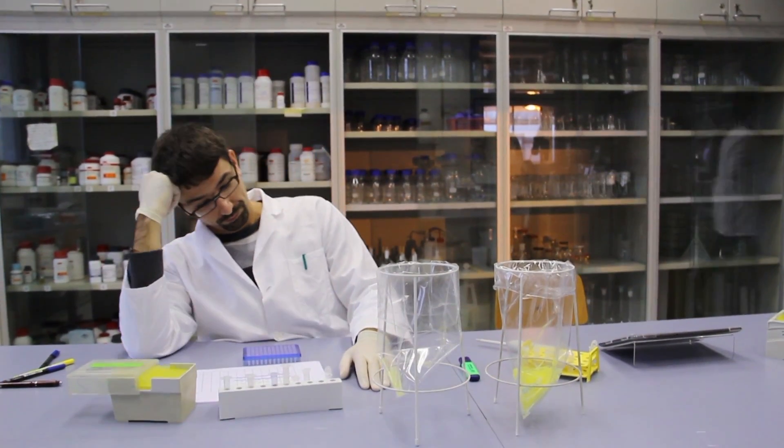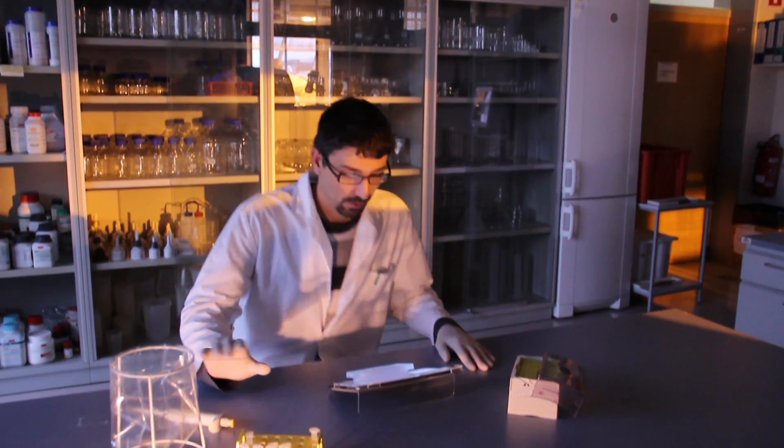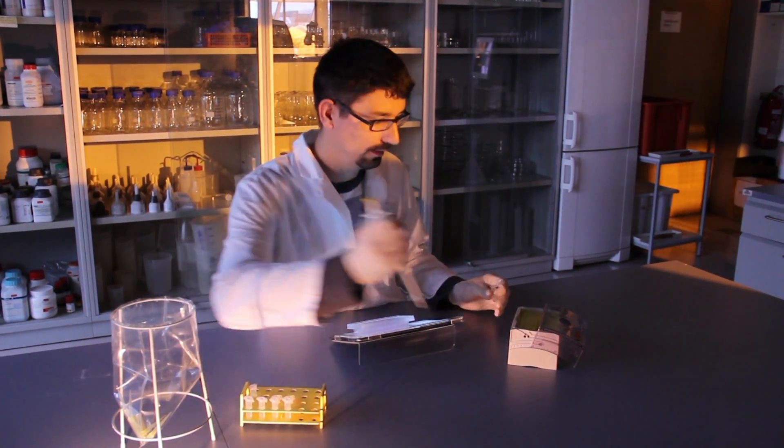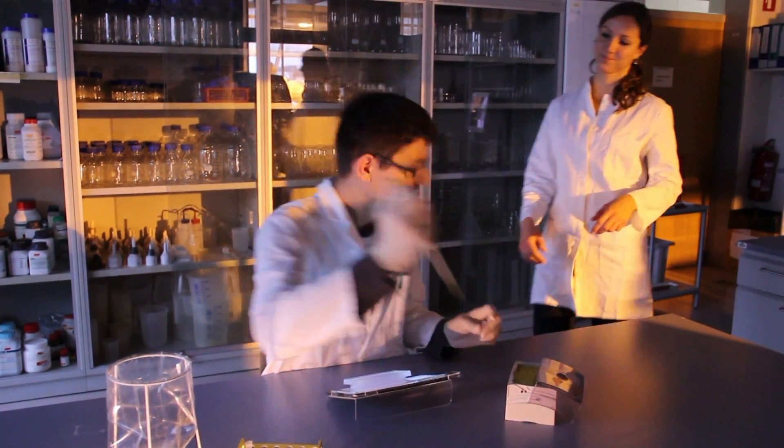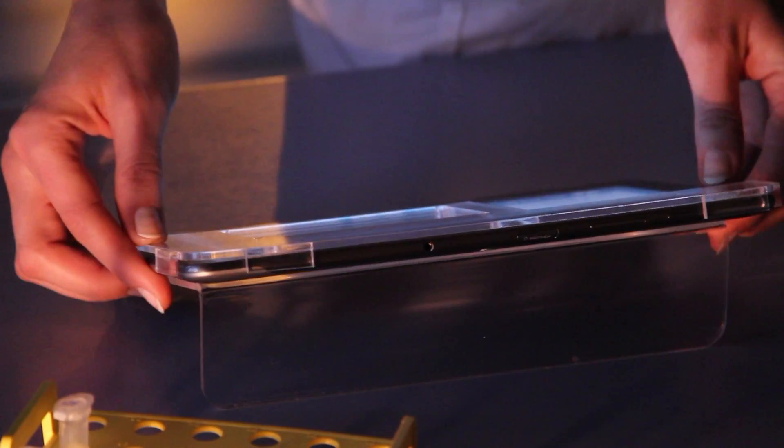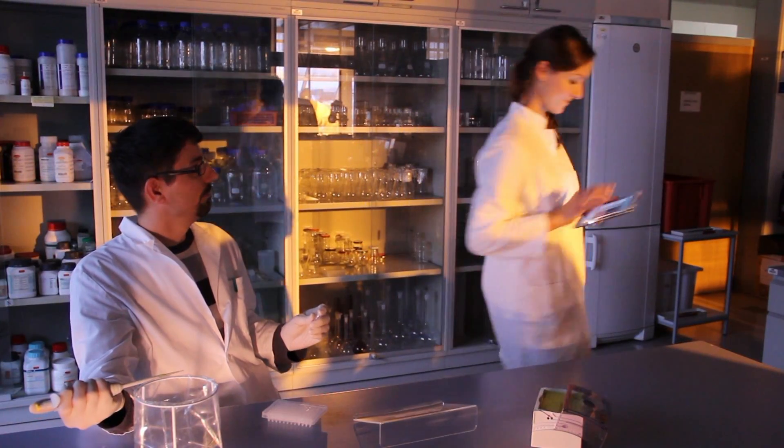Platter operates on the newest Samsung Galaxy Tab 2, so after lab work you can enjoy having a great tablet computer and catch up with your emails, watch videos, or make presentations.